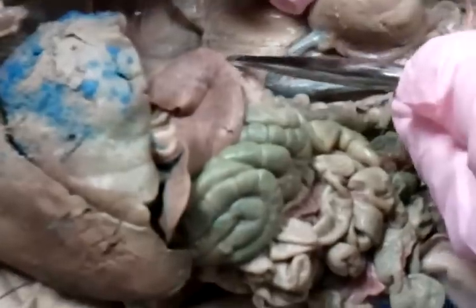Right immediately above the renal artery and vein, you'll see a little tiny branch coming off. See if I can find it here. Did we find your adrenal lumbars? Yes, ma'am. All right, where were they? Yours were kind of hard to find. But any little vessel right above the kidneys, where the adrenal glands are, right here, you'll see little vessels that are going to serve the adrenals. That's the adrenal lumbar. The other thing it's serving is the lumbar muscles, the back wall muscles.